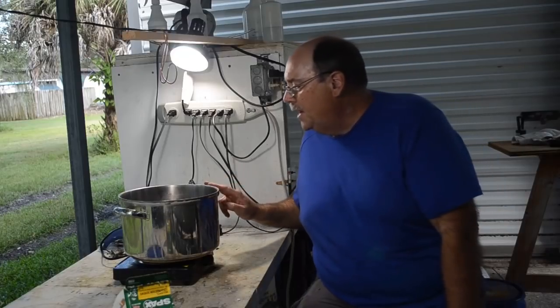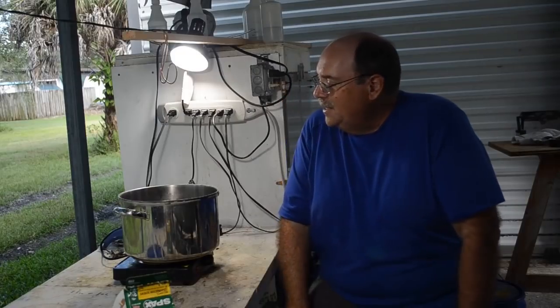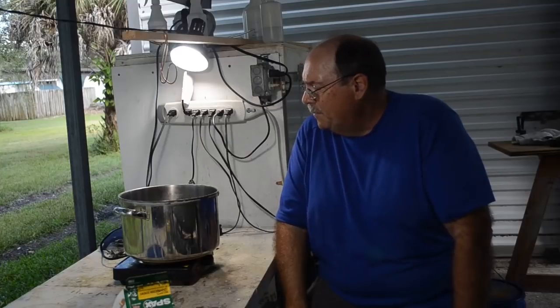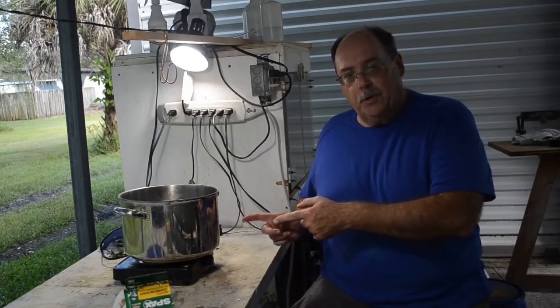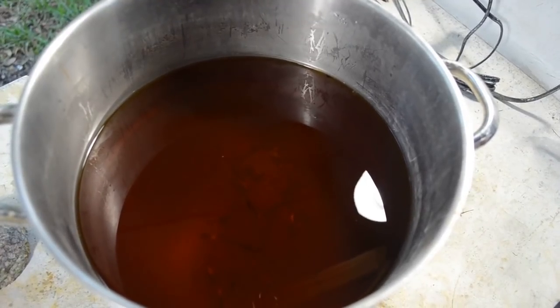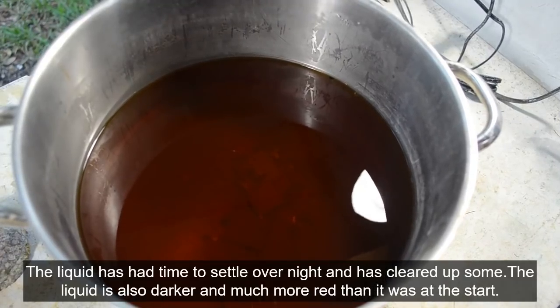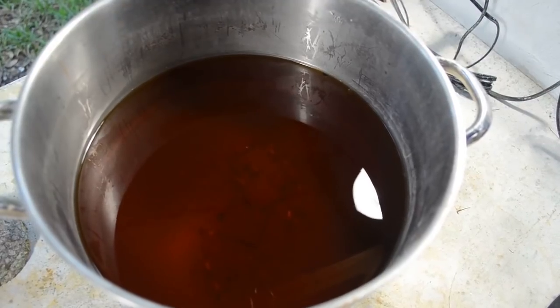And it is kind of muddy and opaque-ish and nasty. It's not nearly the clear liquid that we started off with. It's gotten a lot darker and there's some stuff suspended in it. So I'll get set up to do the filtration here shortly. I'll give you a look at the liquid first as it is. Yeah, it's kind of ugly looking stuff. It's not near as clear as it was. I could just barely see some stuff on the bottom that made it through the basket and fell to the bottom. So filter that out, plus filter out whatever solids are suspended in the liquid.